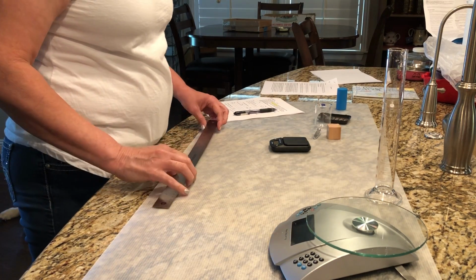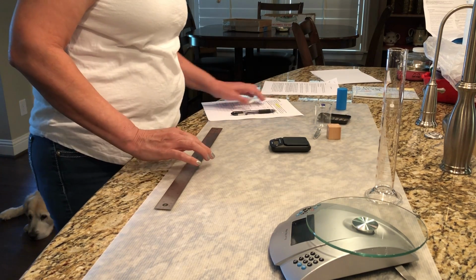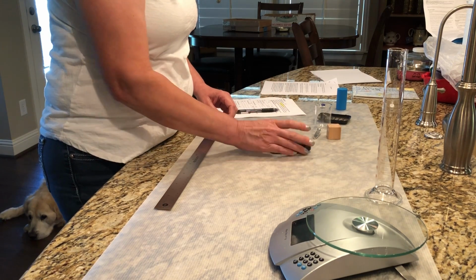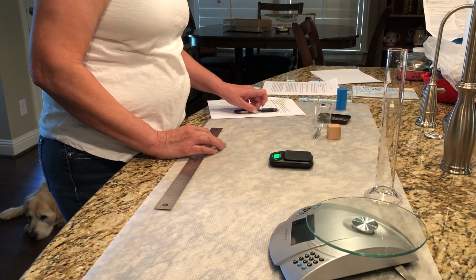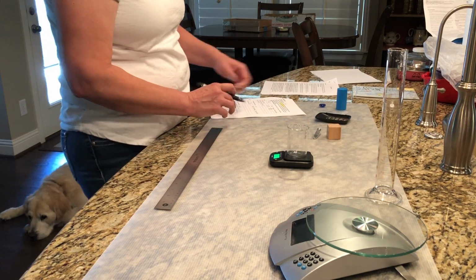This is Heather Carlisle. I'm doing lab number 2. So I am going to do some measurements of mass. I'm going to tare my scale. I'm going to measure the 50 ml beaker.